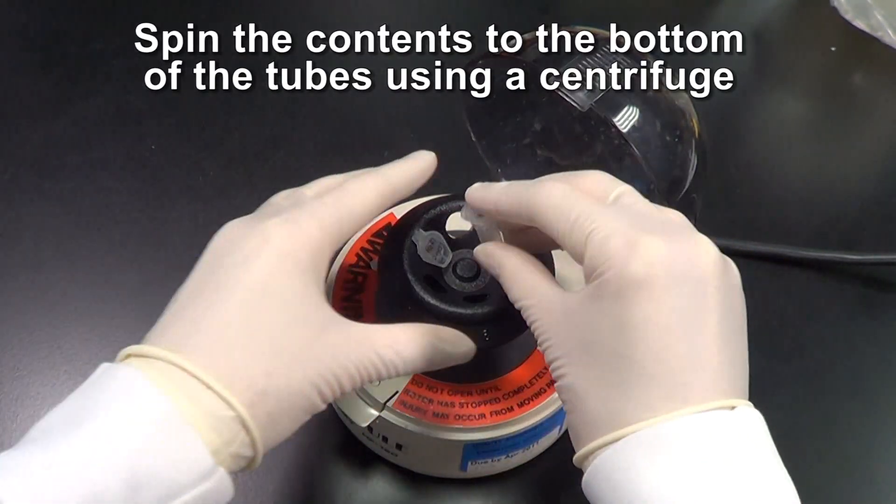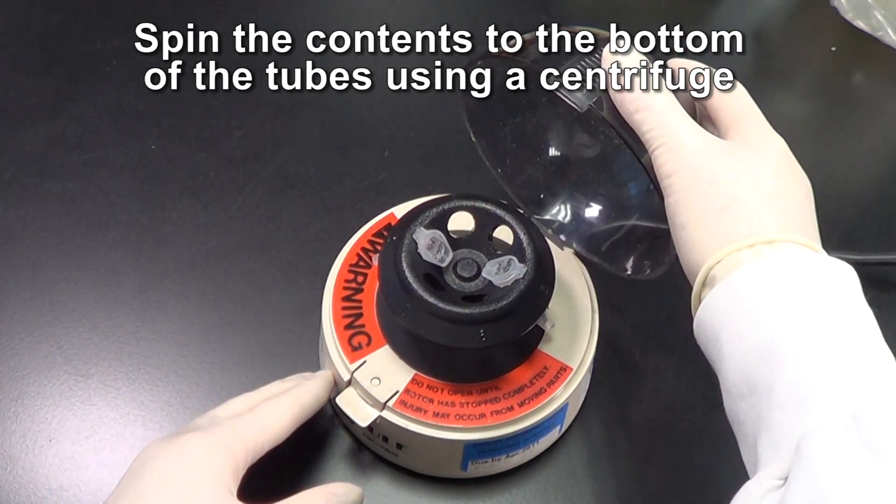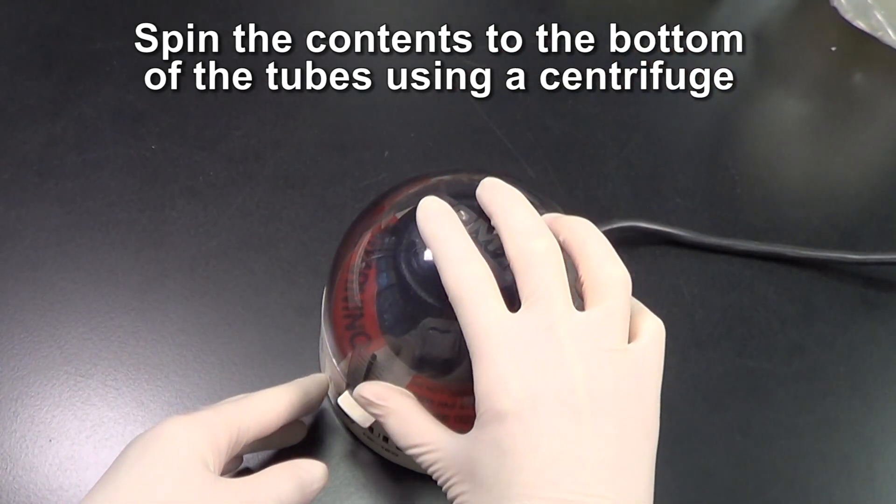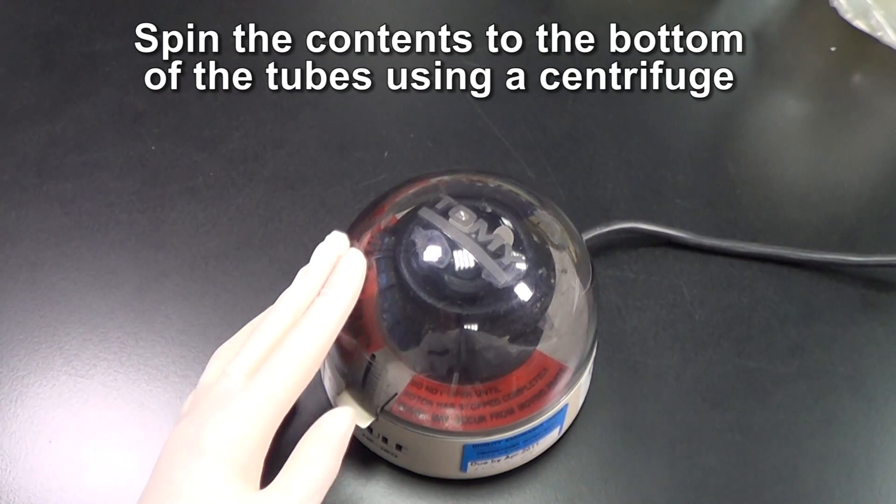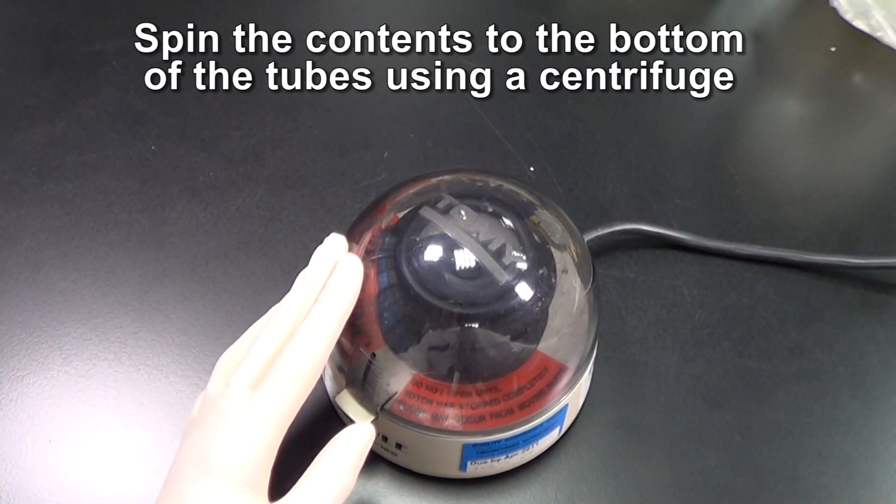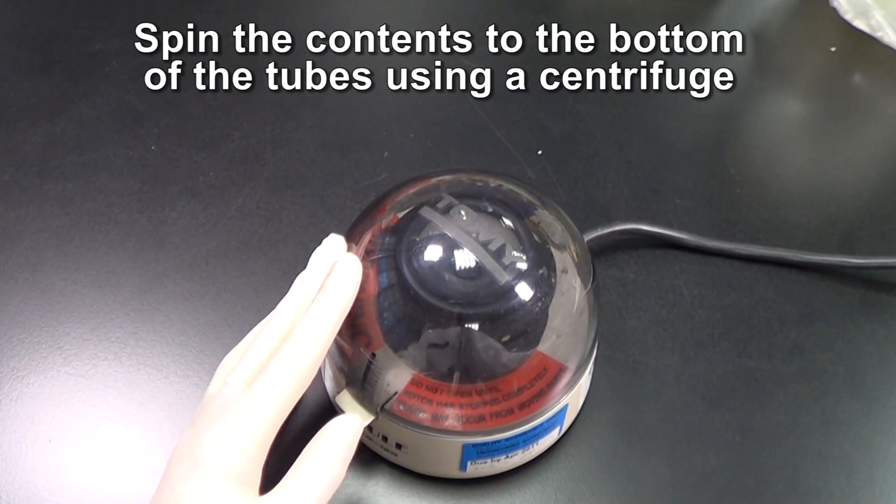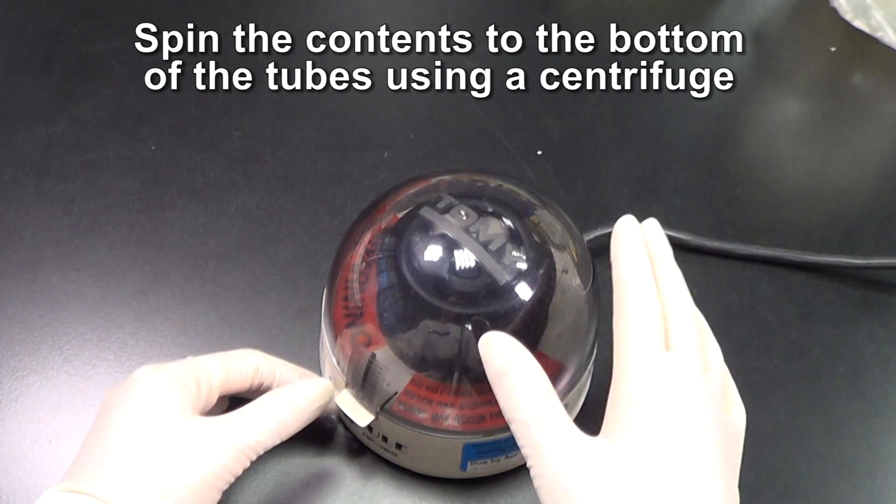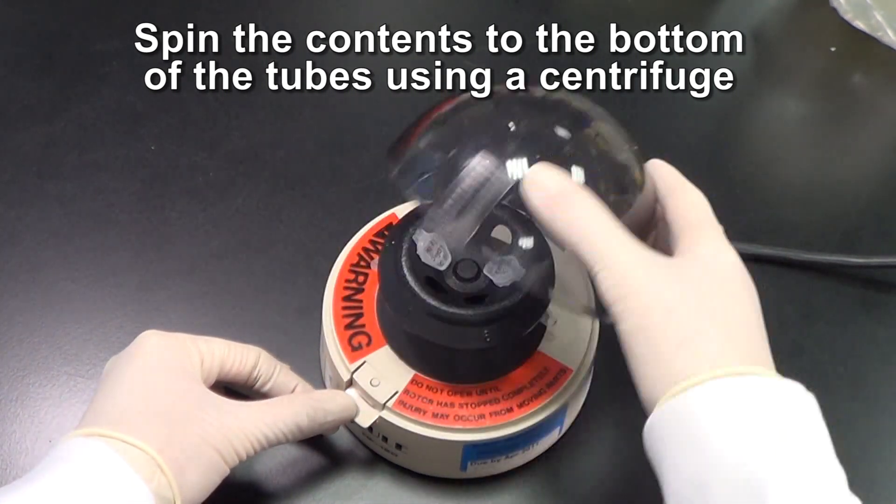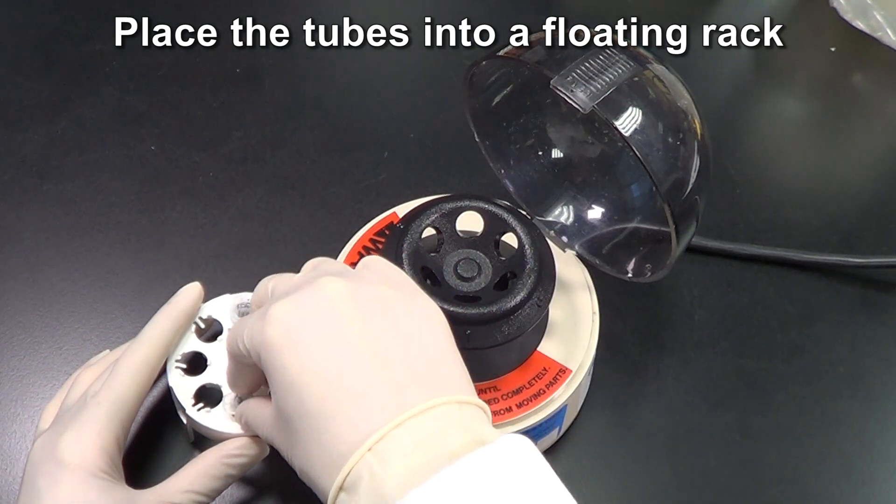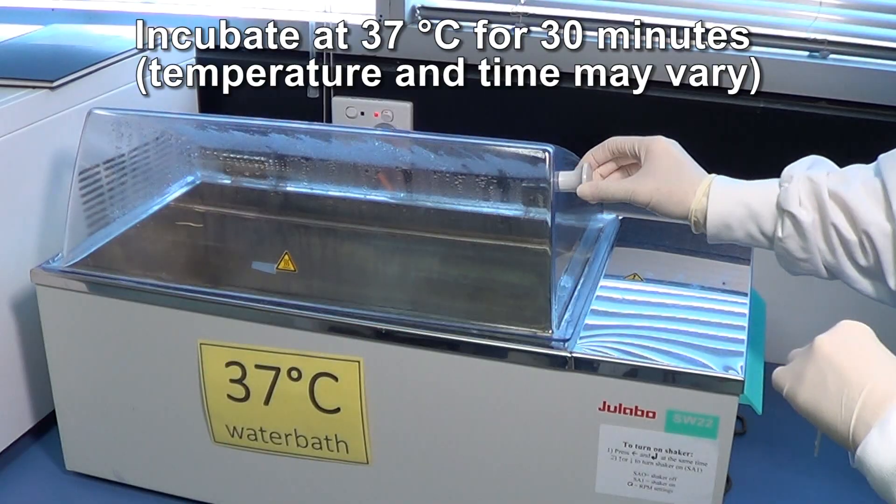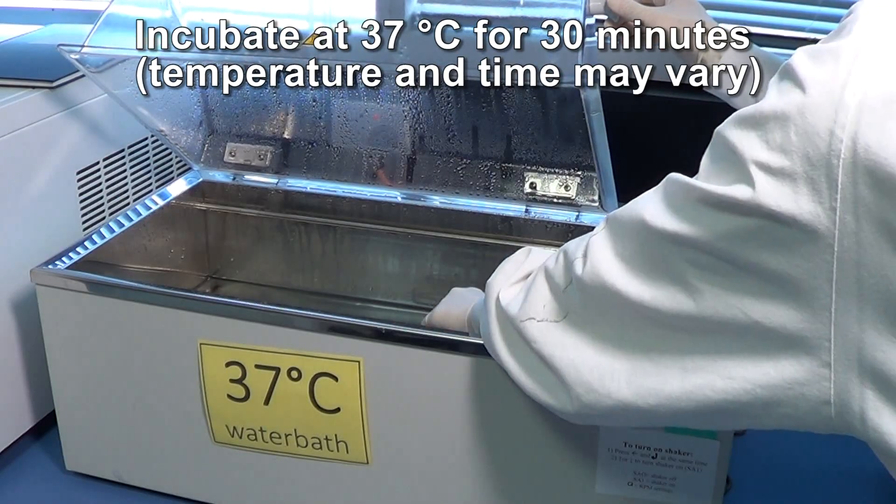Collect the contents into the bottom of the tube by centrifugation. Make sure the centrifuge is balanced. Incubate the tubes at 37 degrees for 30 minutes.